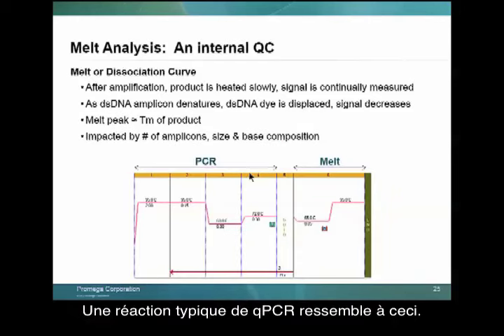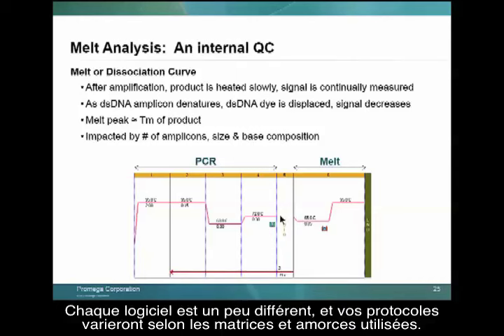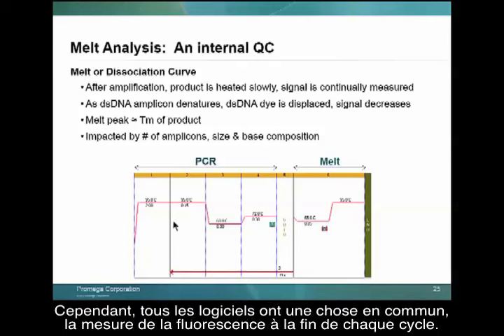So a typical qPCR reaction might look something like this. And I'm showing you a screenshot of the Bio-Rad CFX software. All the softwares are going to be a little bit different, and all of your protocols will be different based on what template and what primers you are using. But the one thing that will be common is that you will tell the software to measure fluorescence at the end of every cycle.